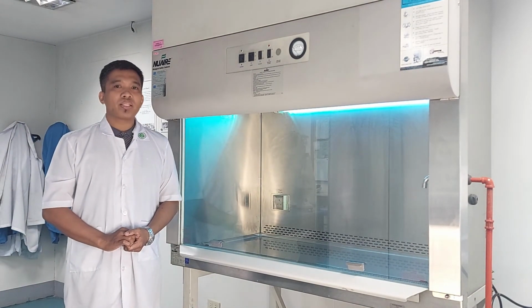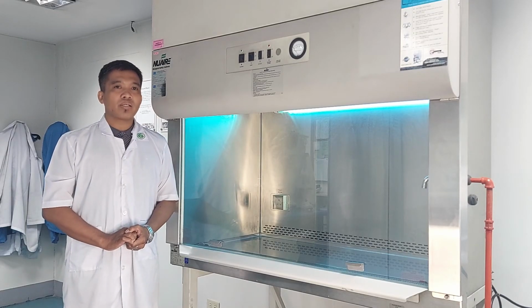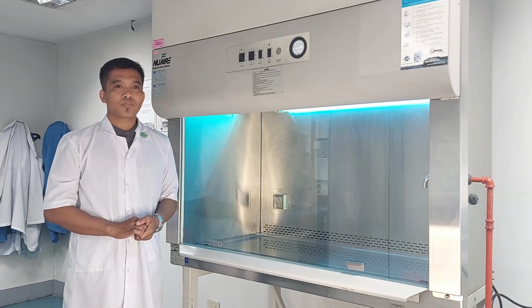To avoid arm movement in and out of the cabinet, plan your work and arrange all the supplies you will need for that particular experiment, making sure not to overcrowd the work area. Use proper work technique. Work clean side to dirty side.